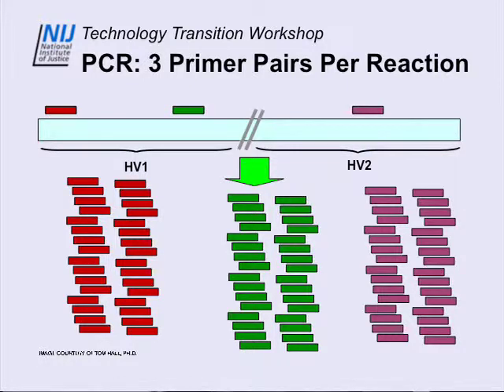Those generate a bunch of product that's sprayed into a mass spectrometer. Well, before it goes into a mass spectrometer, first it's desalted. We use a magnetic bead cleanup that Steve had shown on the instrument, which has automated desalting.